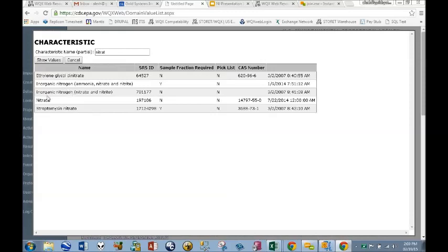You can see that, okay, it was inorganic nitrogen, which is nitrate and nitrite, whereas in my data set, it might have said it without the parentheses. So it's little nuances like that, tables to reference, what is in my data set and what does WQX Web expect. Now, I want you to hold off on any questions about, my data set says this, what can WQX Web do? Because next week we're going to go into what's called translations, and that's more about showing off the flexibility of the WQX Web tool to actually work with your data set and vice versa.